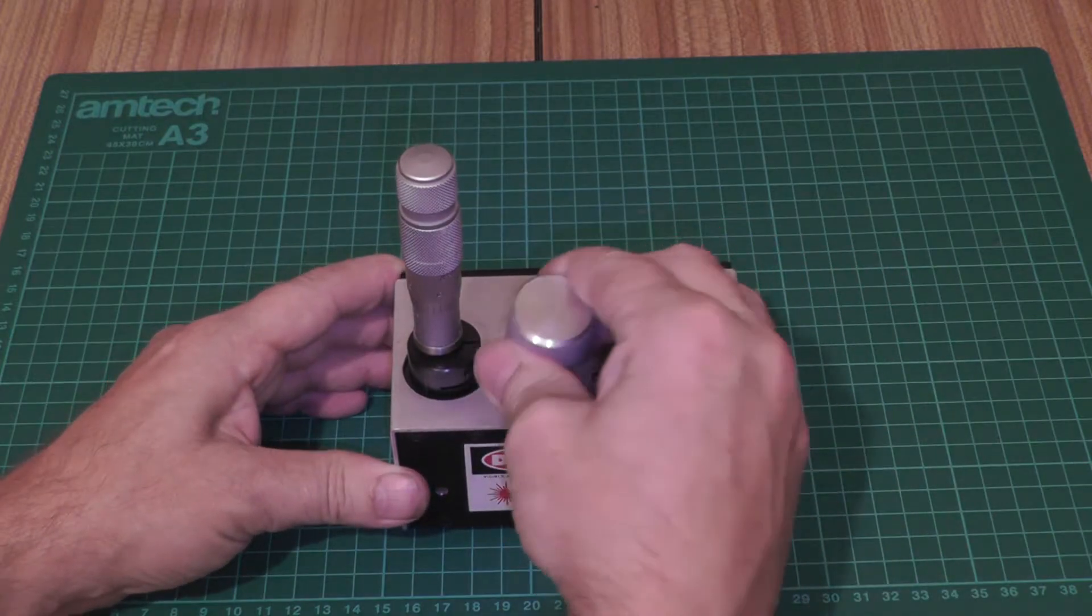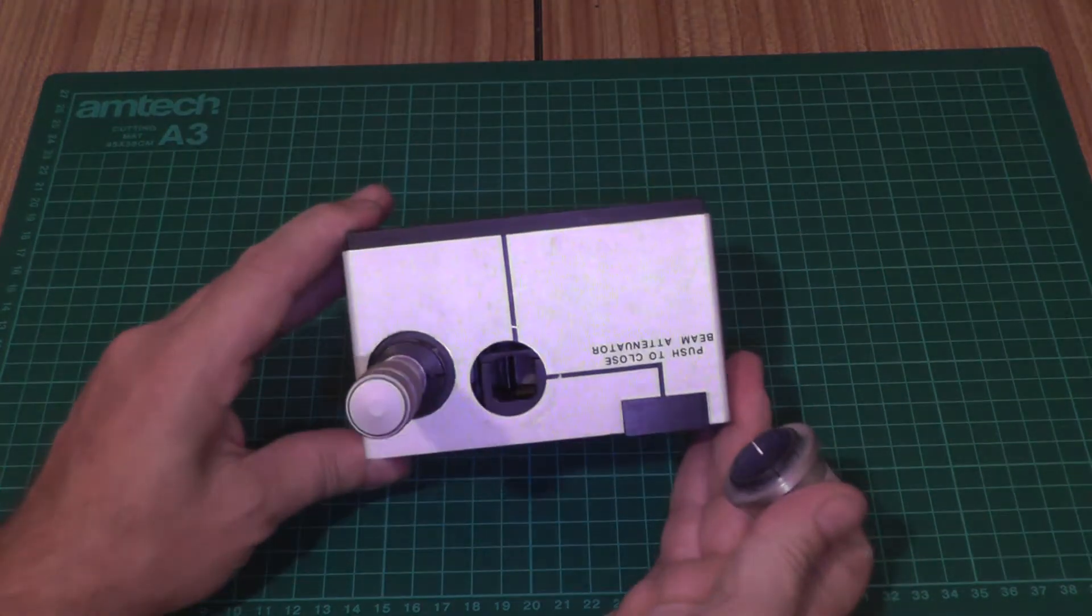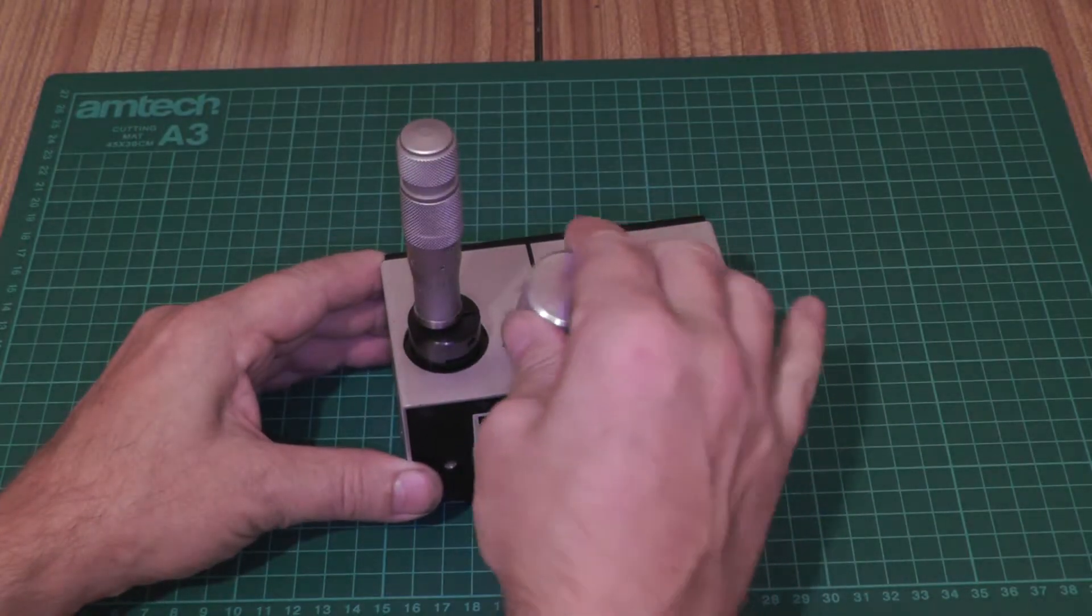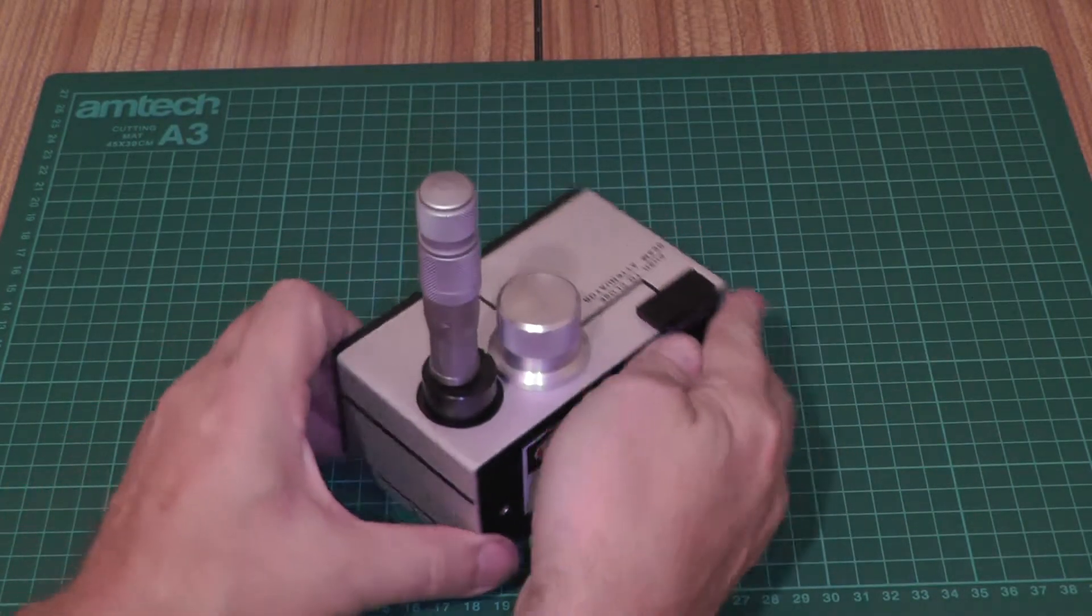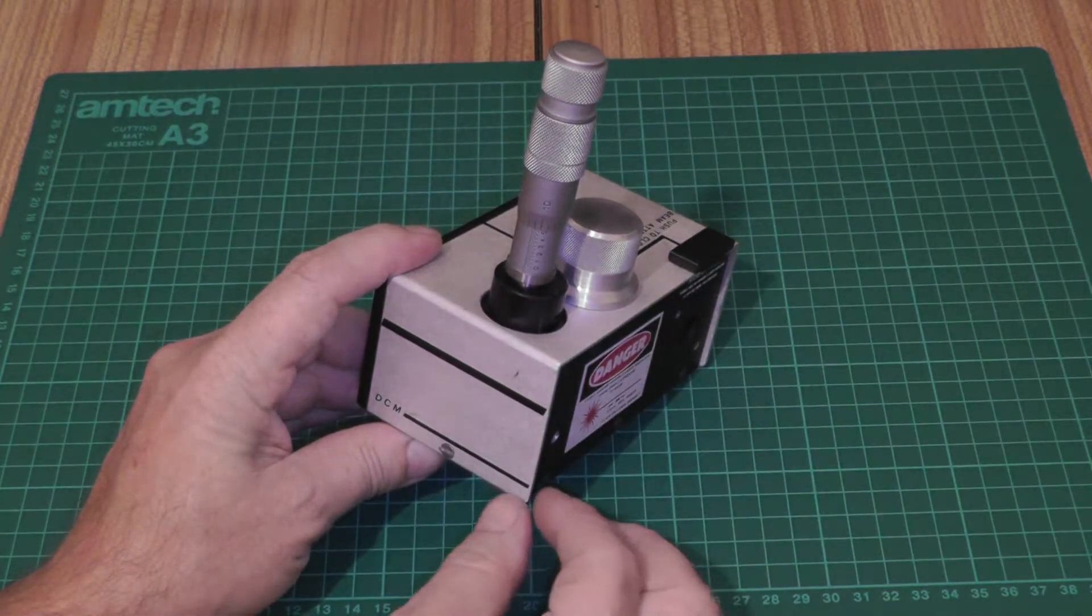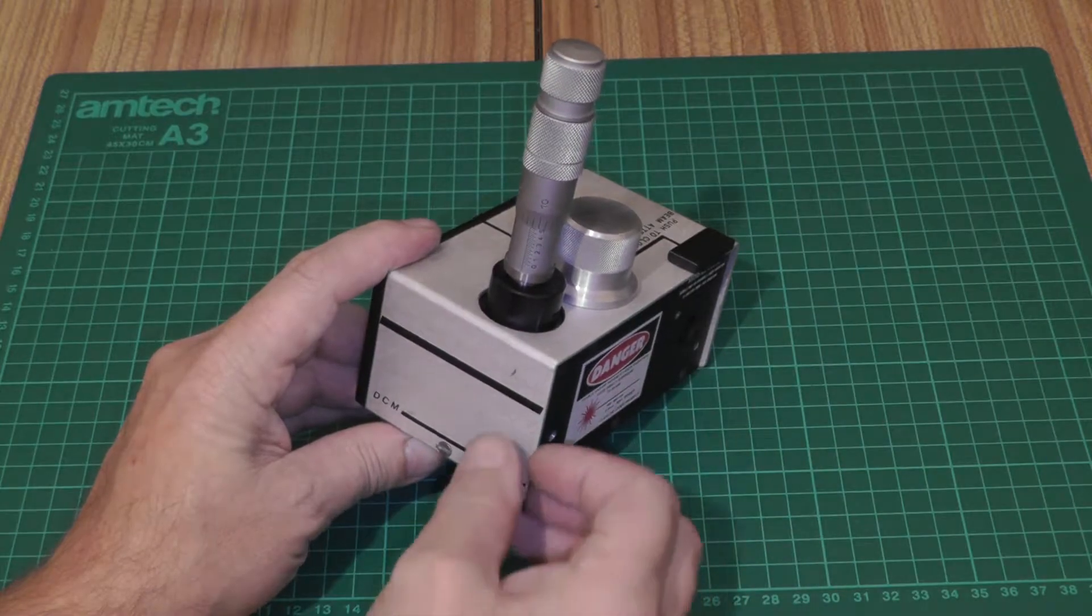On the top we've got a lid, and this is where you would put the cuvette. Then most importantly for this dye laser it's actually got a micrometer head where we can adjust the angle of the grating and change the wavelength.